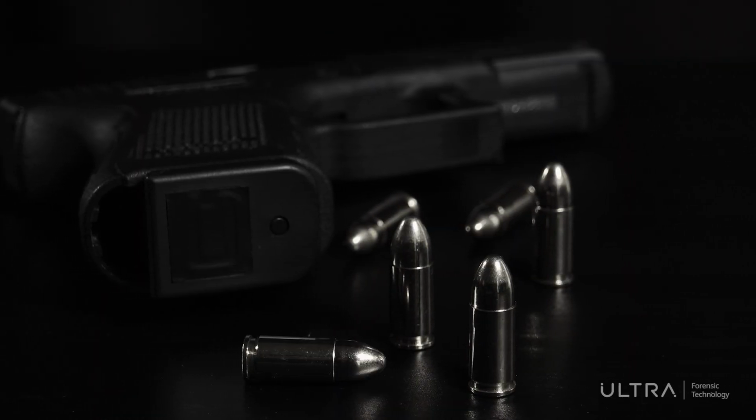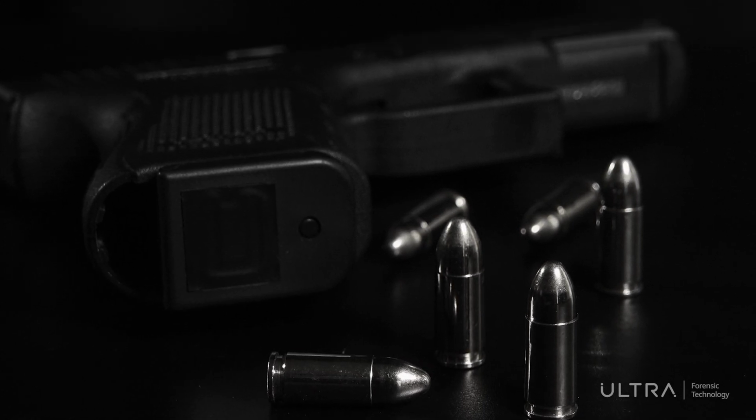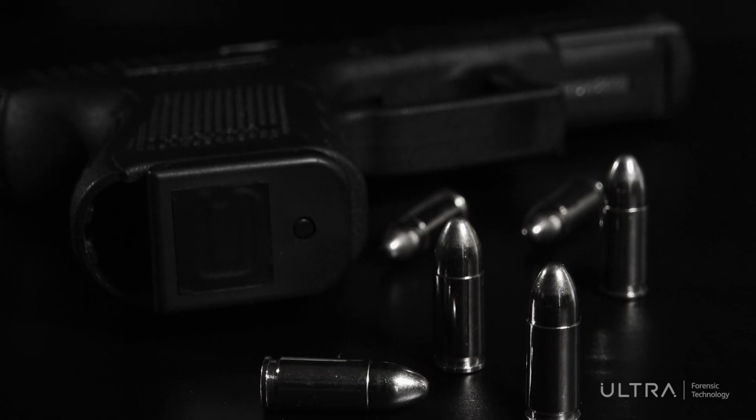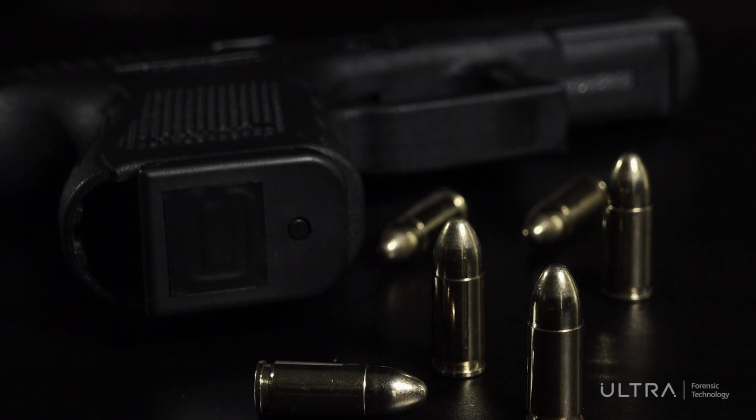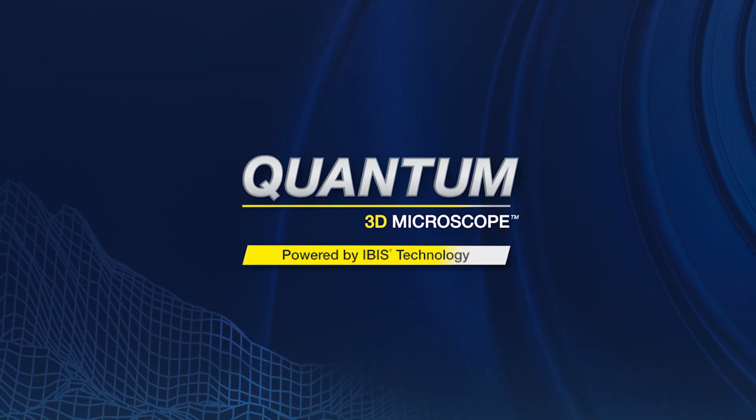Quantum has laid the foundation for more innovations to come, such as new objective measures and a similar product for cartridge cases. This is a game changer for firearm and tool mark examiners, innovating today for a safer tomorrow.